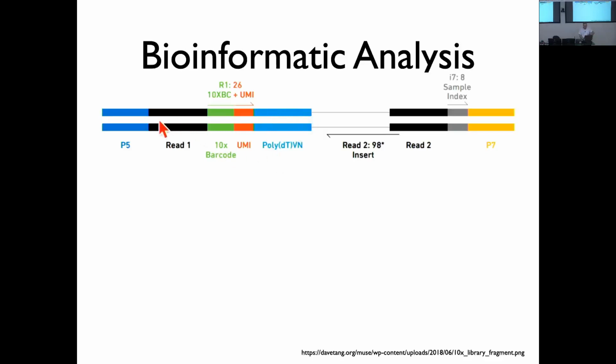And so often, with the data that you get from 10x sequencing, for the R1 read, if the sequencing facility is flexible, you would say to them, okay, I just want 26 base pair reads on this. I don't need 50, 100, 150 base pairs, because I just care about the 16 bases of the cell barcode and then the 10 bases of the UMI. Nothing else is interesting here. And then read 2 is the biological sequence. Those will often be short, like 100 base pair, 75 base pair. So you can save some money. Instead of doing 150 base pair paired-end reads, you can do 26 forward reads and 75 or 100 base pair reverse reads. Does that make sense?